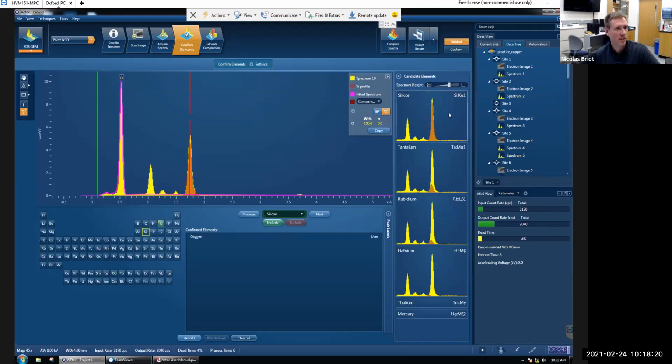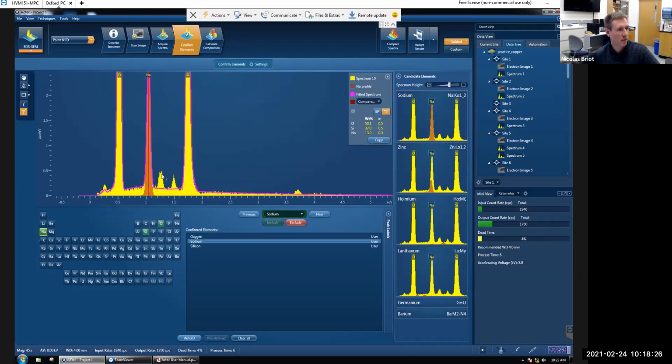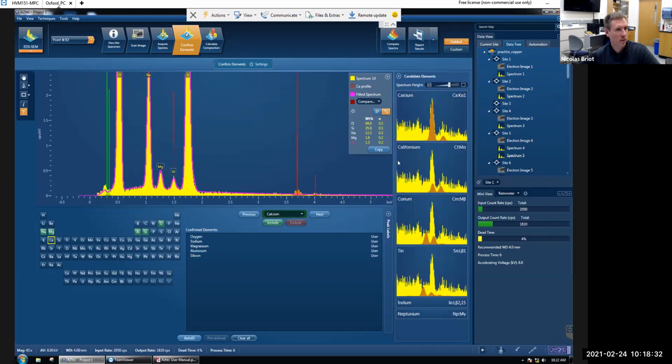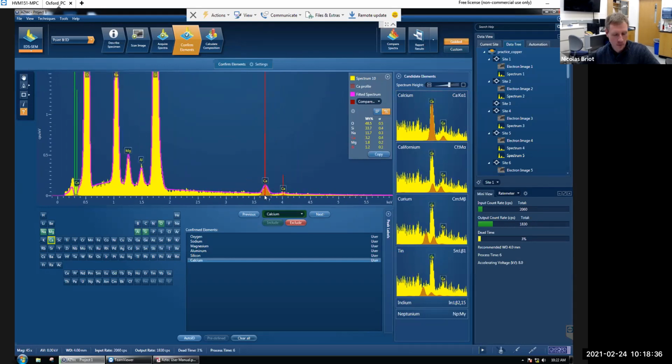Oxygen, and you're going to have silicon, that's glass, right? Of course. Sodium, you're right. Magnesium, aluminum, calcium. All right. Your silver should be about here. Okay, we don't see it. I didn't load. Let me check something.